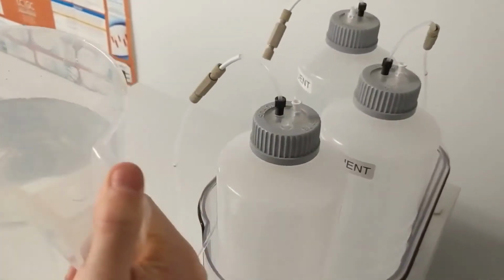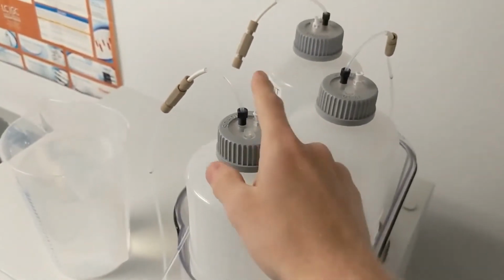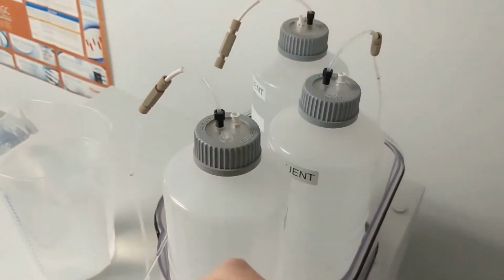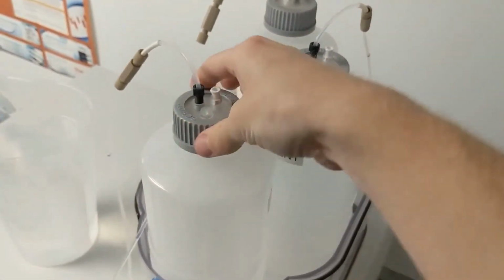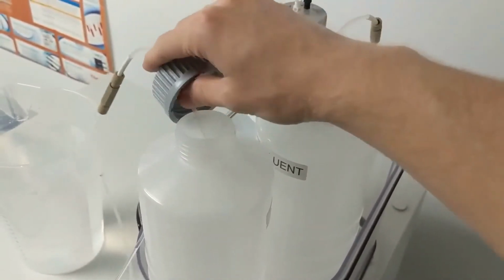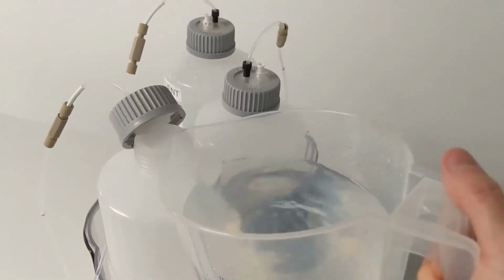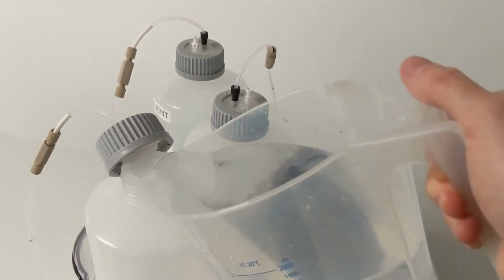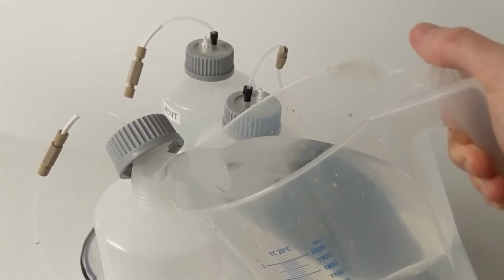Now, there is a trick to filling up these bottles. Most of the time when you're filling these up, the pumps are going to be running, so it's going to be continuously drawing out of these lines. You don't want to pull these lines out because then it'll draw air into the instrument. You want to slightly open this up and just move it to the side a little bit so that you can slowly pour your water in. And you'll have to do this twice, once for cations and once for anions. And you will need to do this at least once every 24 hours.